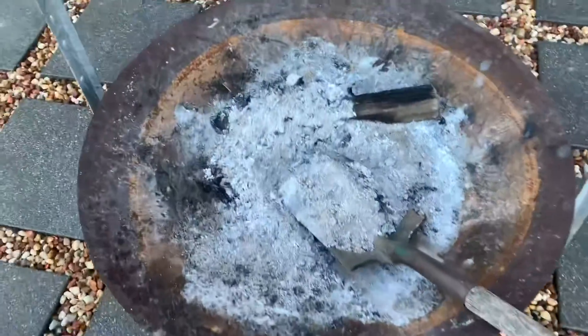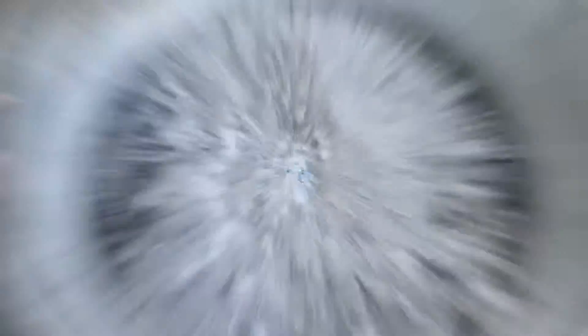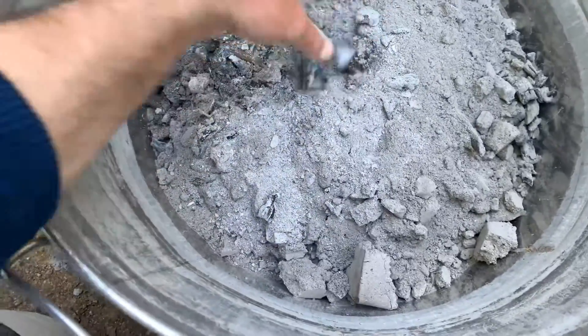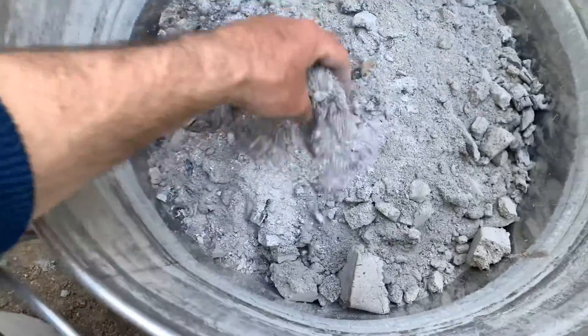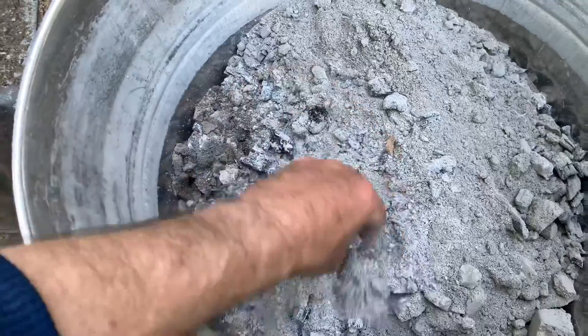I'm going to be collecting the wood ash from the fire drum — simple as shuffling it into a container, taking it down the back and processing it. Now that all the wood ash and charcoal from the cooking fire has been collected, we can go ahead and sieve it using the screen, and that will remove the charcoal pieces and leave the ash at the bottom of that container.